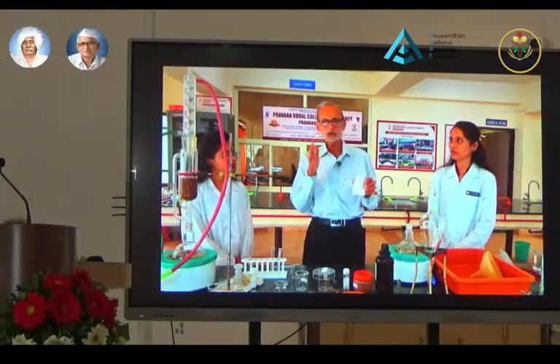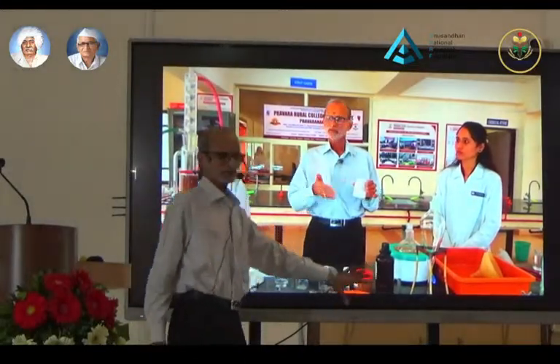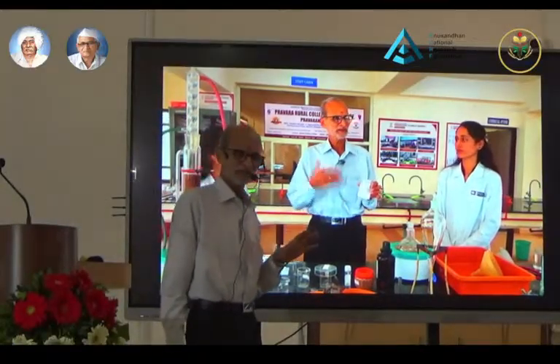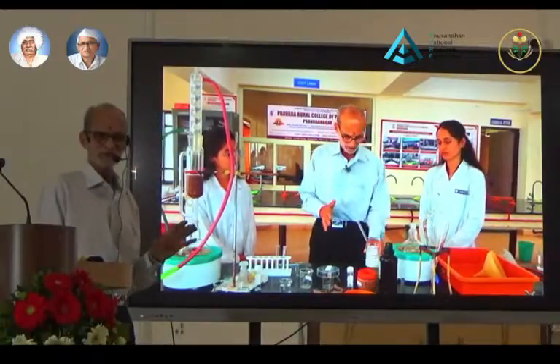Okay, I think there's some problem with the audio, so I will explain it to you. This is extraction and isolation of quinine from cinchona bark. Cinchona bark contains quinine as an alkaloid, and the method of alkaloid separation is very simple.